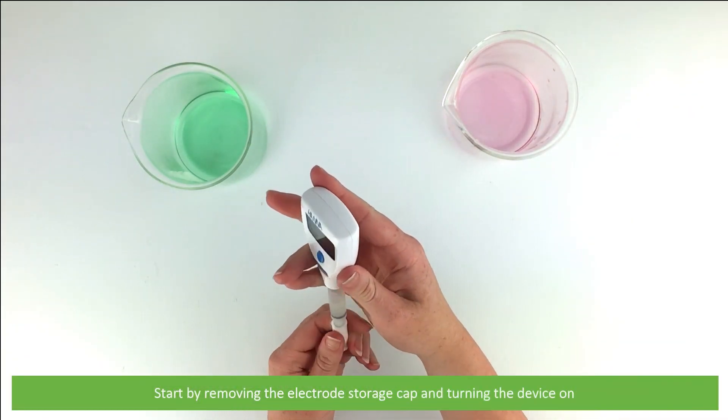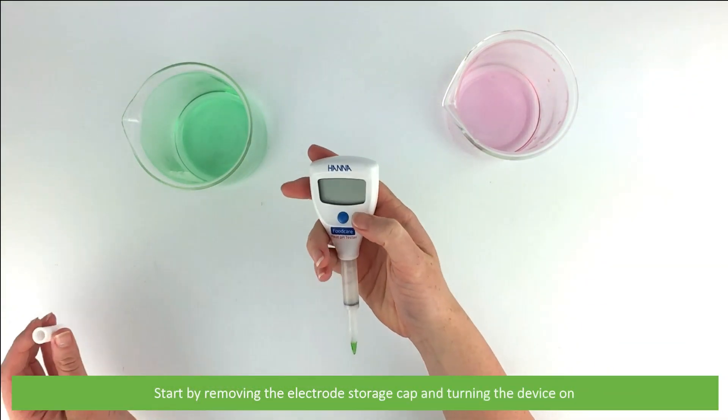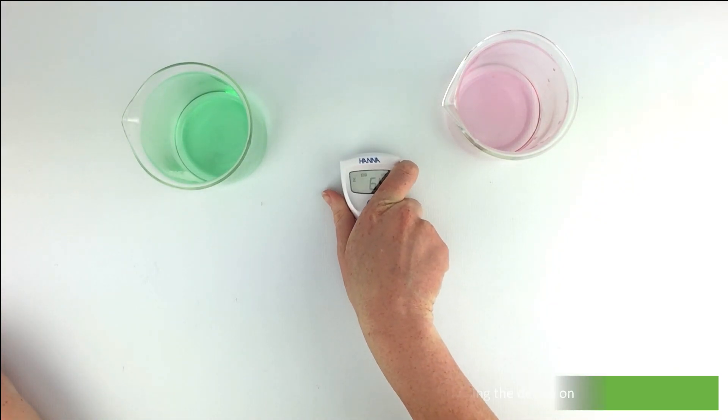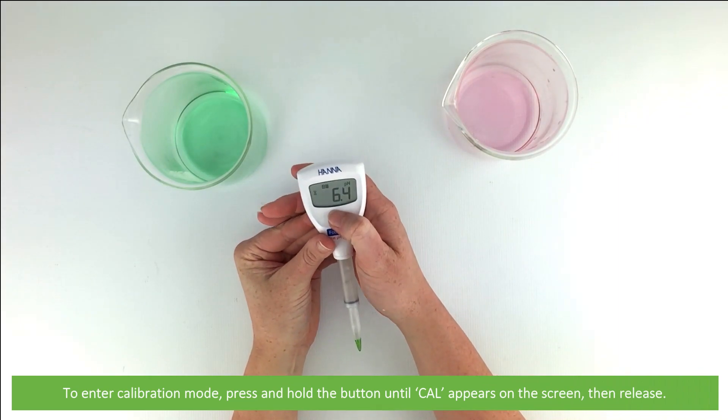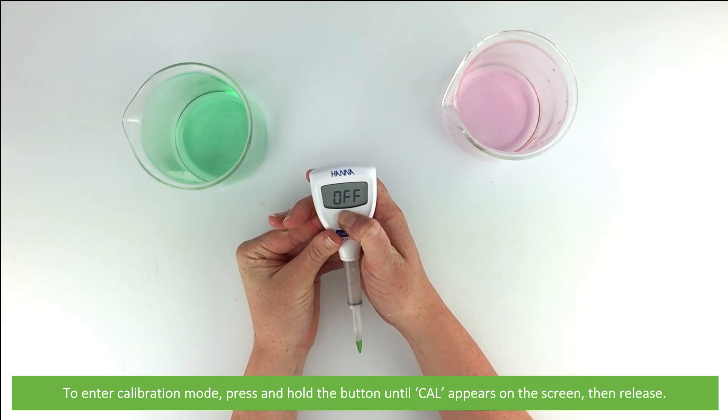Start by removing the electrode storage cap and turning the device on. To enter calibration mode, press and hold the button until 'CAL' appears on the screen, then release.